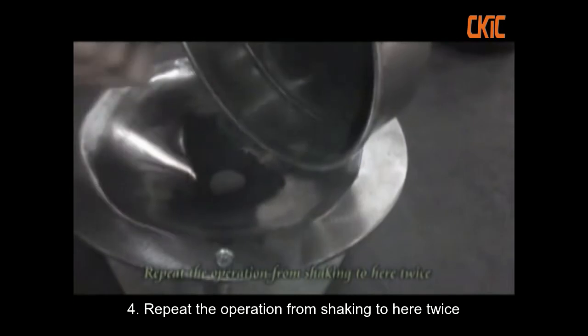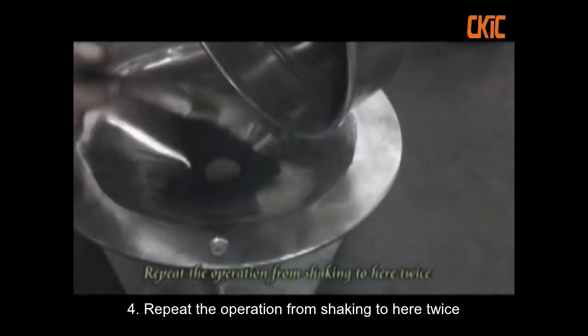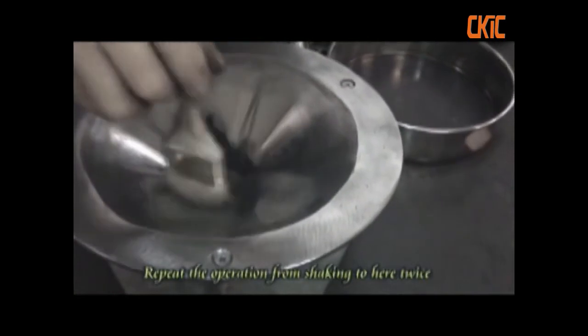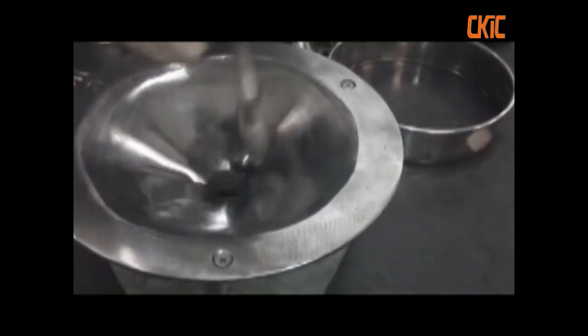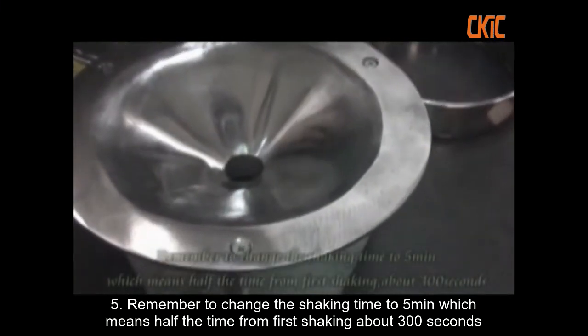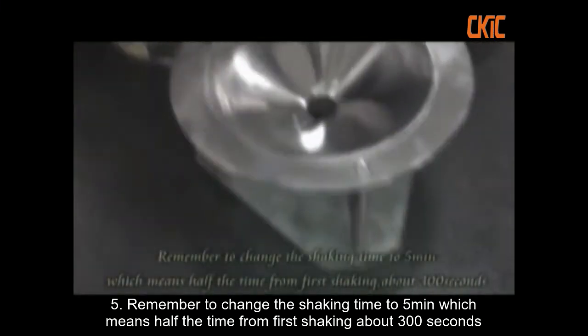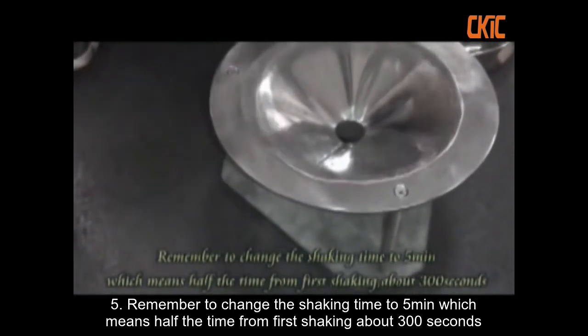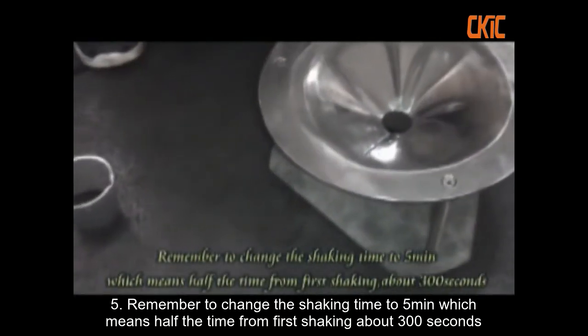Repeat the operation from shaking to here twice. Remember to change the shaking time to five minutes, which means half the time from the first shaking — about 300 seconds.